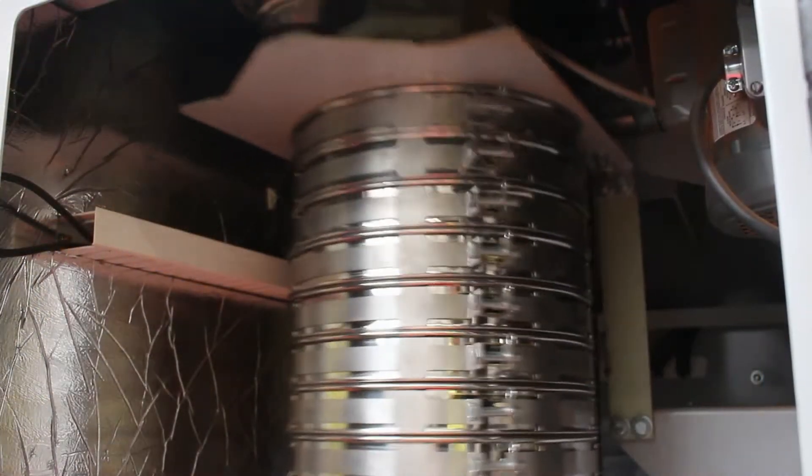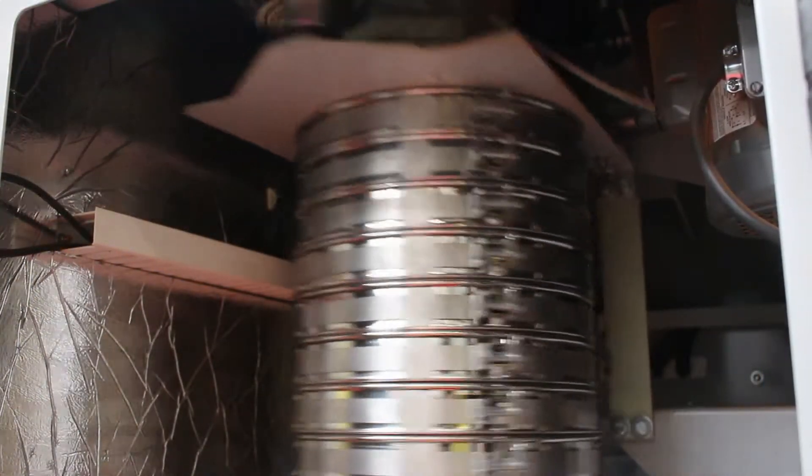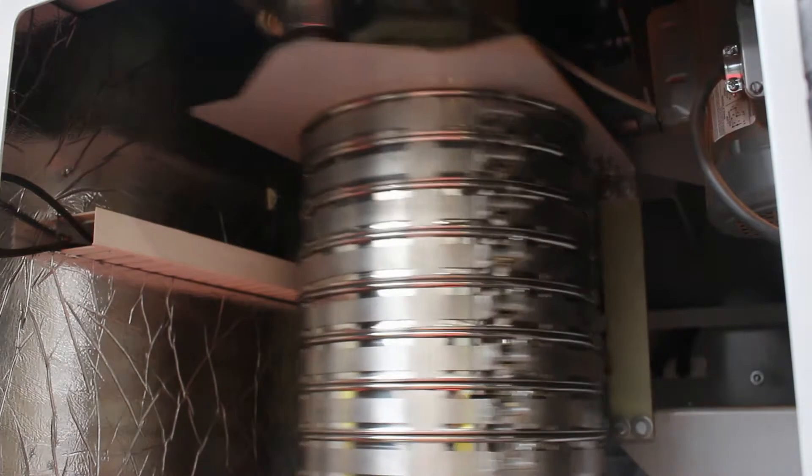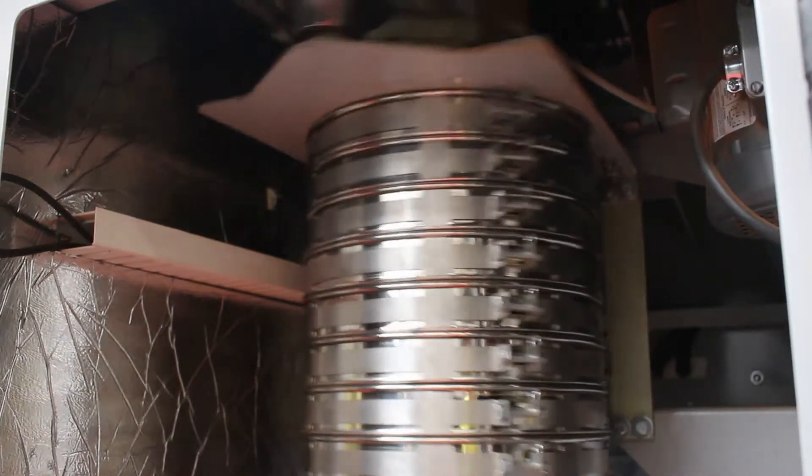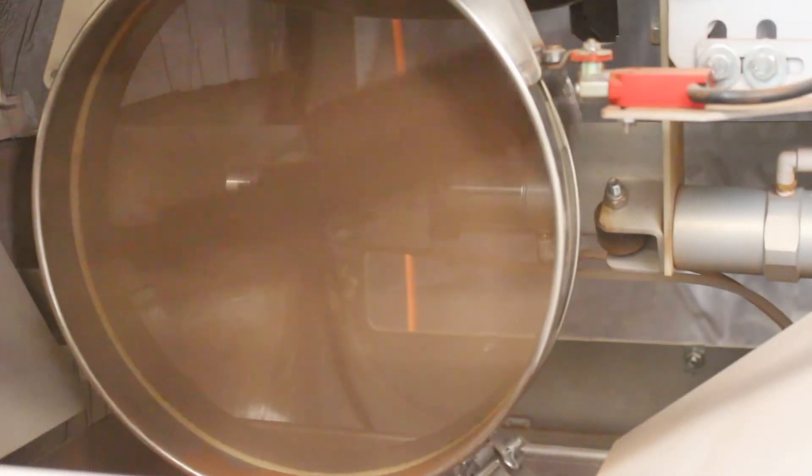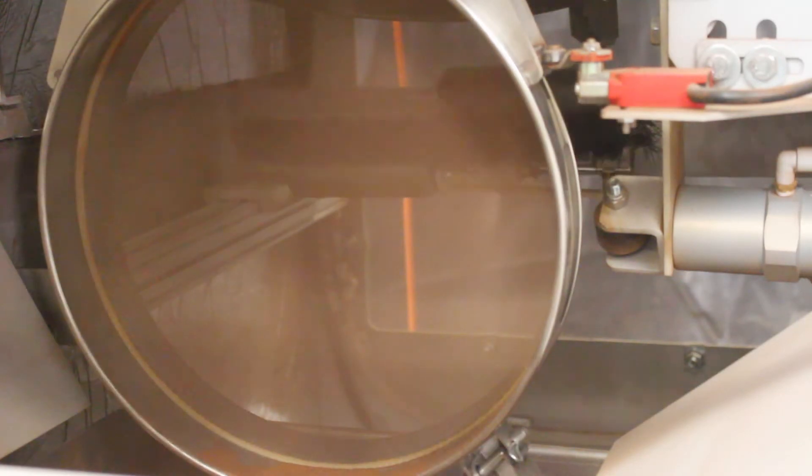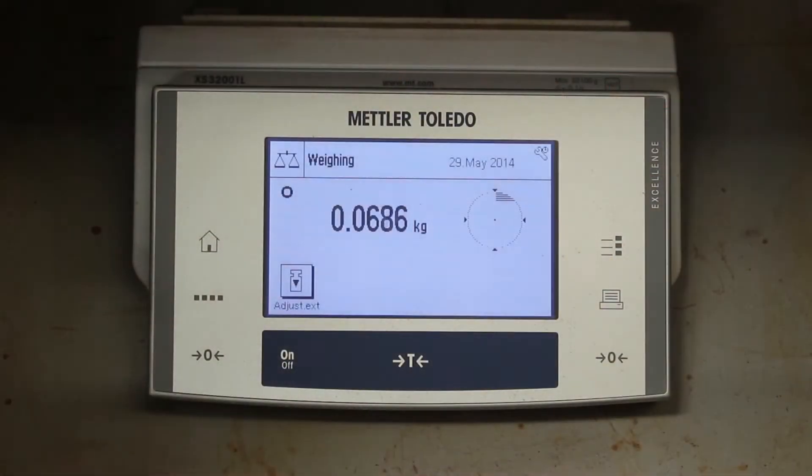It uses the same shaking and tapping action as other manual sieve shakers on the market today. At completion of the shaking cycle, each sieve is automatically brushed, vibrated, and weighed.